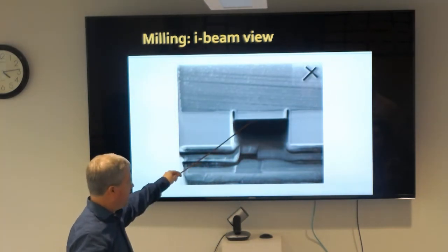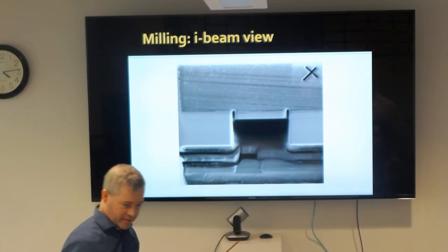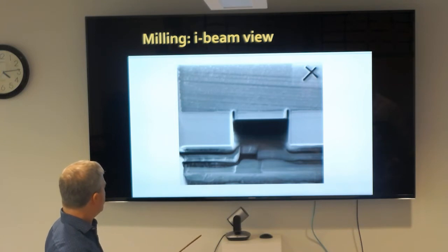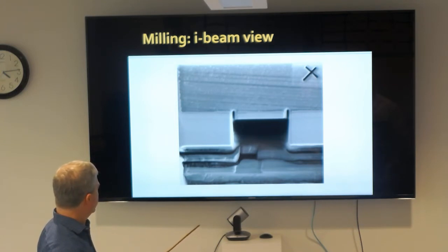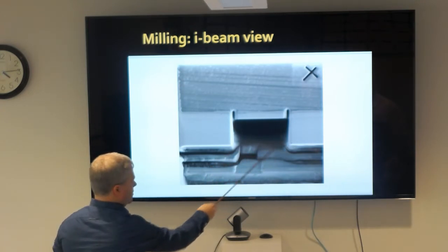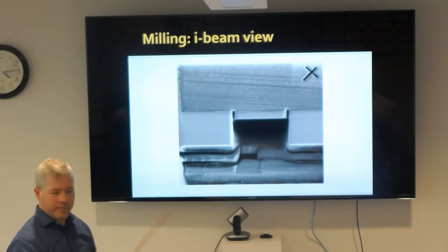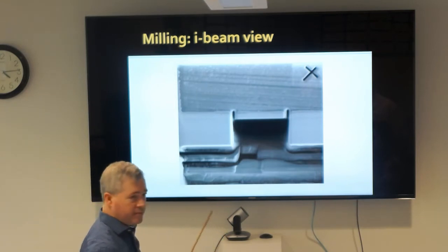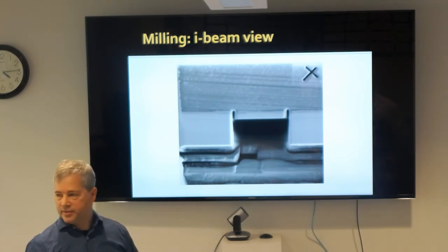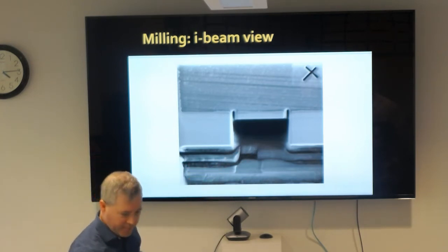So this is vastly sped up. This probably took 3 to 5 days to cut that far. What's the depth right there? What is that scale about? I would estimate this is probably 20 microns across here. I didn't put a scale bar on it, unfortunately. So you're going in about 10 microns? It doesn't matter how deep in the Z, because you can just keep going. It's longer than the field of view, but it ends up being further in. You're cutting in very far here. Got it. So that's why it looks like a very deep hole.